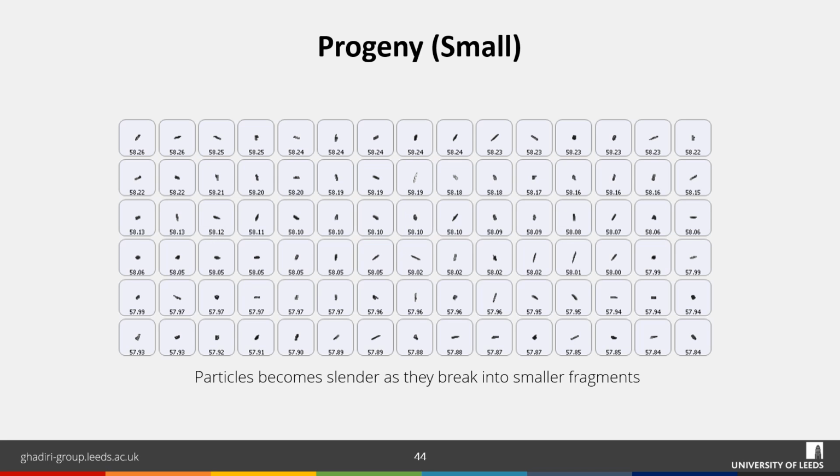Conversely, if we now look at the broken crystals which have got smaller size, it is very clear that those smaller crystals are slender in general, which explains the trend that was observed earlier. Evidently, carbamazepine dihydrate crystals could break either by chipping off the corner or snapping along the longest dimension.